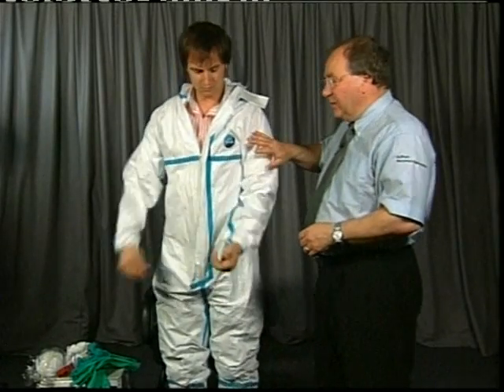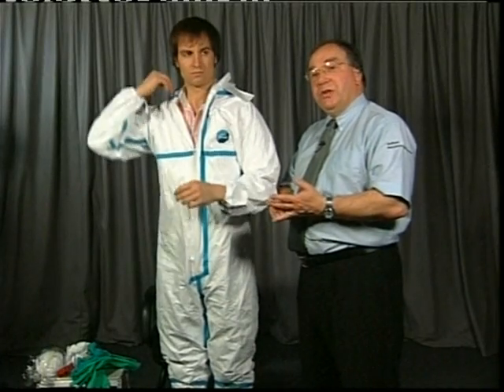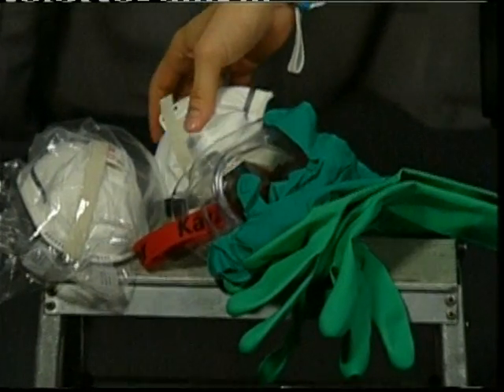Dress to this level without going any further. What you would now do is put on your goggles and respirator because you want them inside the hood rather than outside. This gives you better protection and means there's less chance of contamination on straps when you finish.